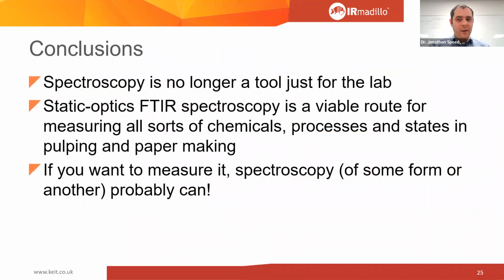So in conclusion, spectroscopy, it's no longer a tool just for the lab. 20, 30 years ago, it was a lab-based tool and it was really powerful. But nowadays it's finding its way online. It's a core part of Industry 4.0, and it's what's going to drive the change to automation, big data, and artificial intelligence-led processes. Spectroscopy is going to be a core part of that.